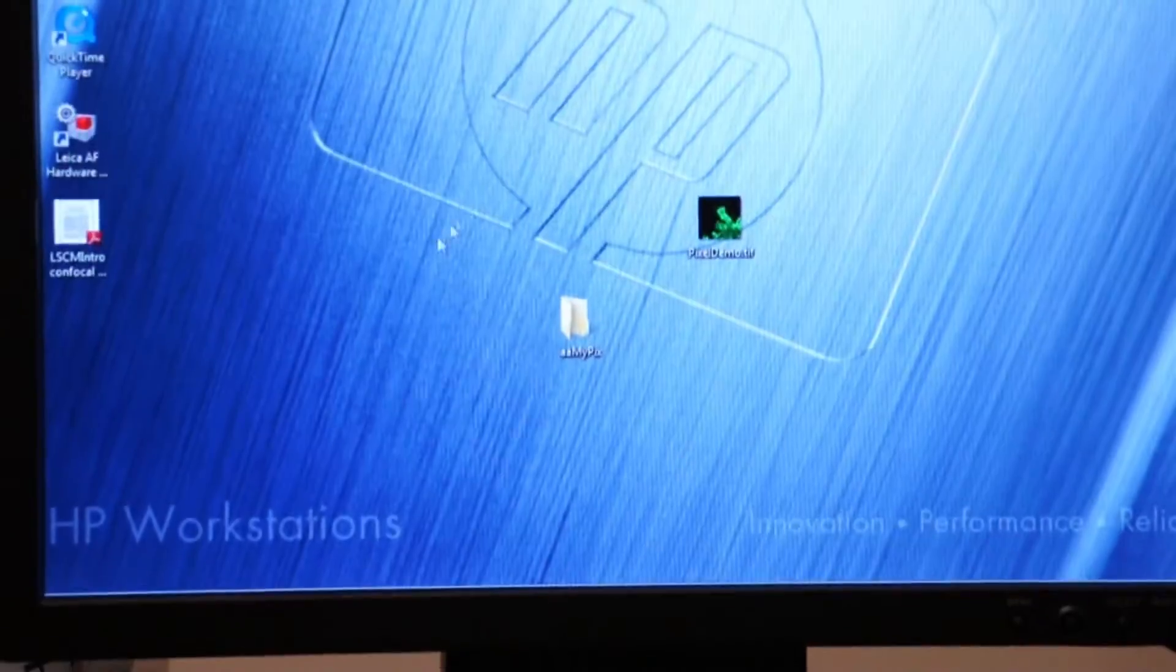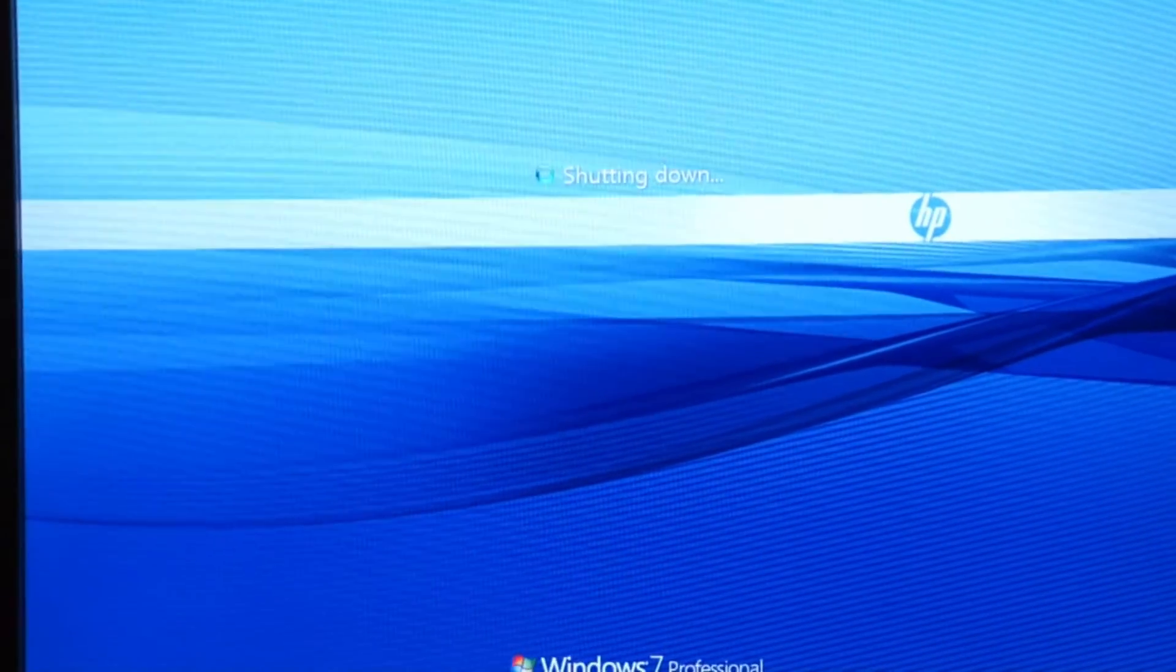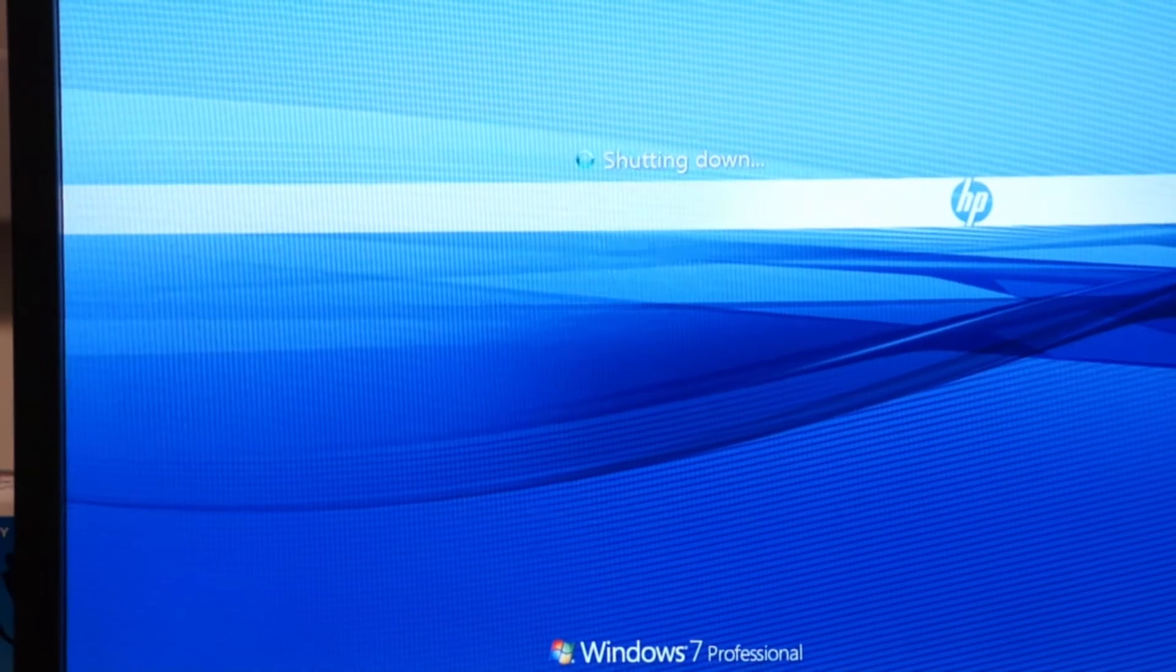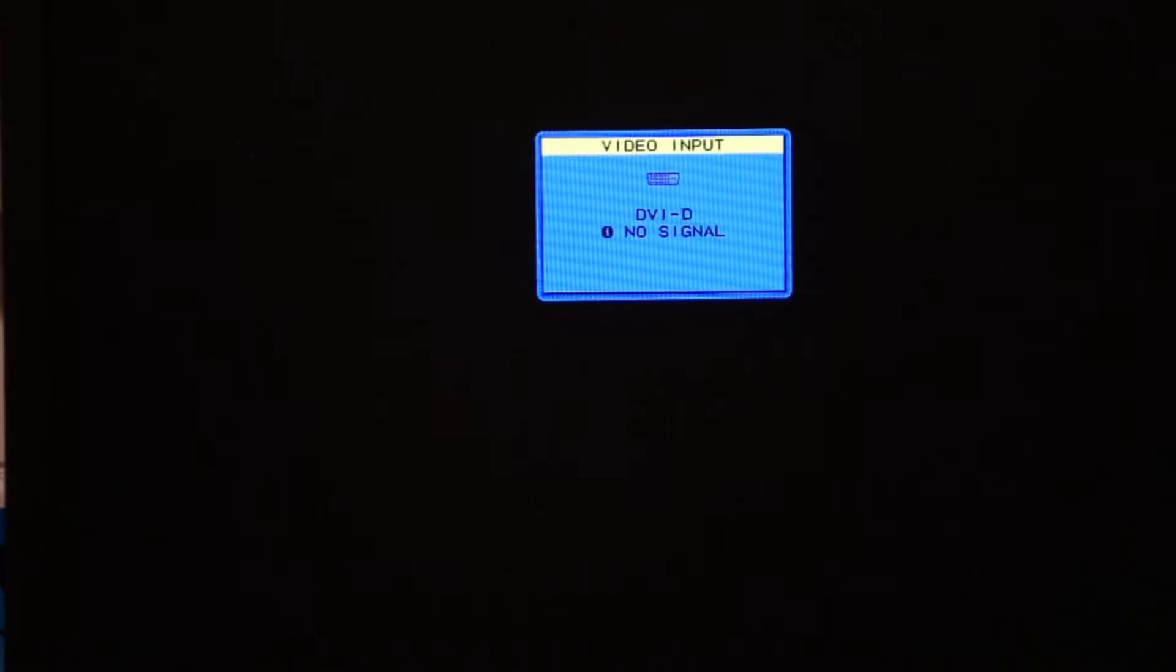Now that I'm at my Windows screen, I can turn off Windows, and the system will exit Windows. And then I can check my microscope to make sure it's completely shut down.